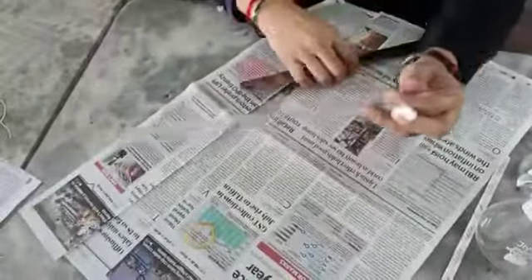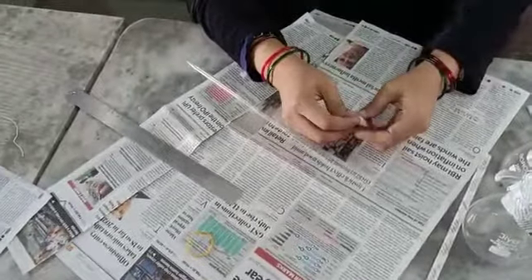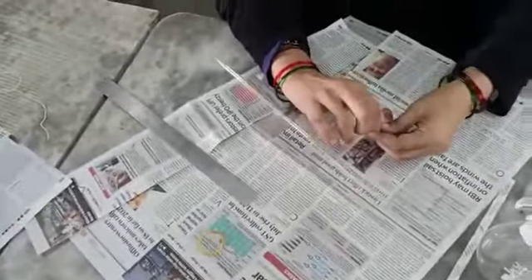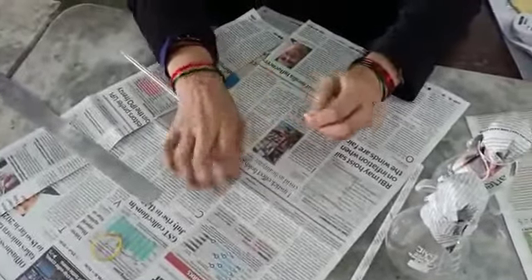Look at that. Now see what we should focus on here — it is having two ends. So both should be covered. That's why we are completely covering it. In case of a flask, you will have seen that we just cover one opening, but here two openings are there. That's why we are completely covering it.